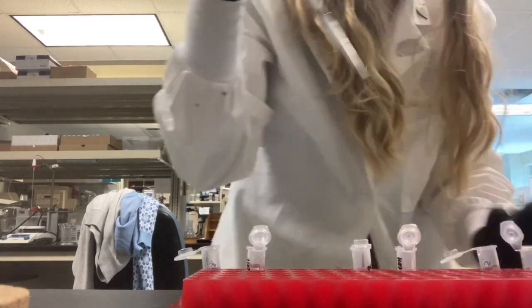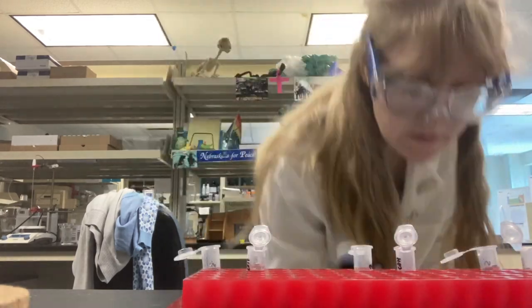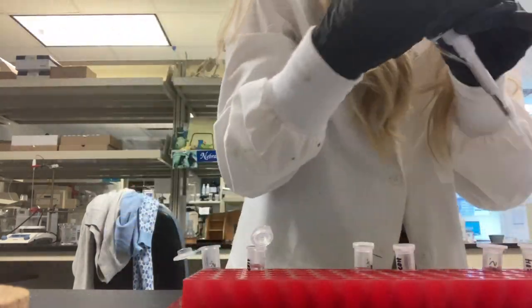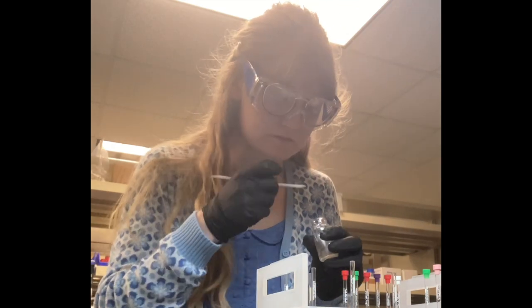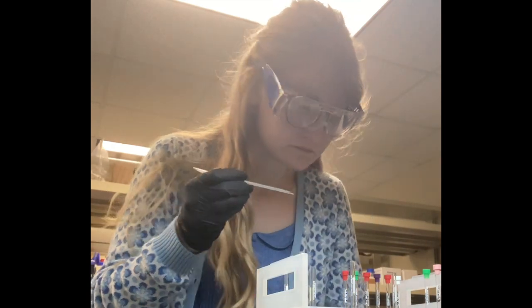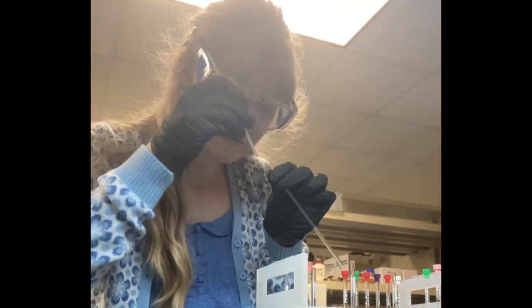Here I am mixing my compound that was in methanol into the formic acid solution that will be put into the mass spec. It's very, very dilute and very sensitive. Sadly, the mass spec did not work out today. So I decided, why not shoot an NMR because that can't be more complicated? I was wrong.